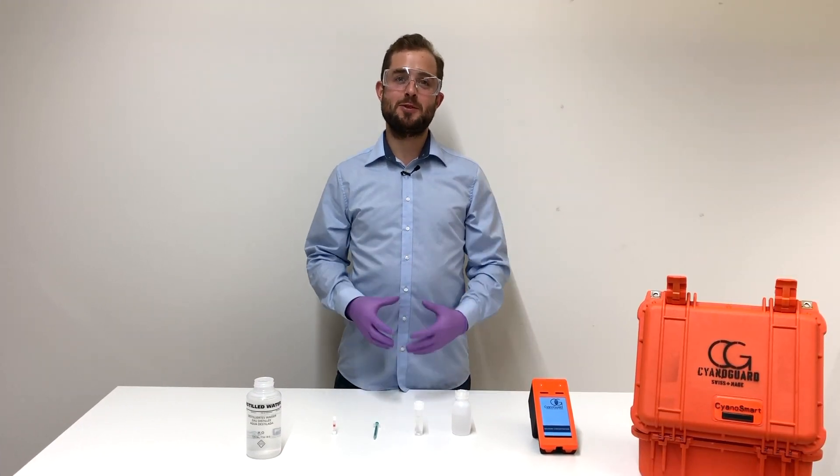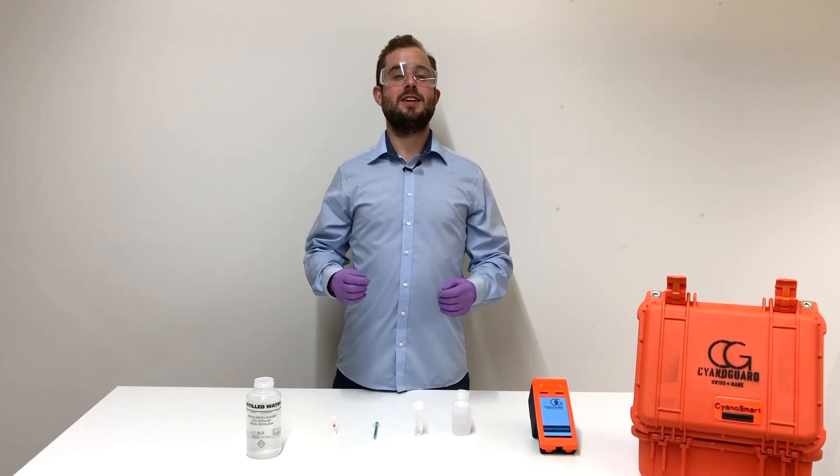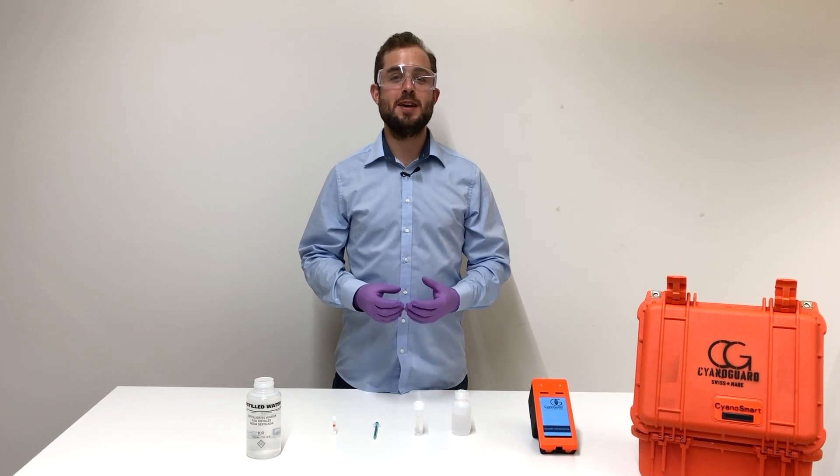I'm Benedikt and today I'm going to show you how you use the CyanoSmart system and make your cyanide monitoring much simpler.